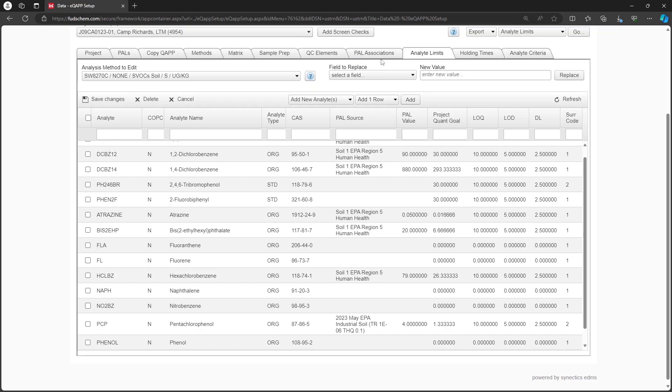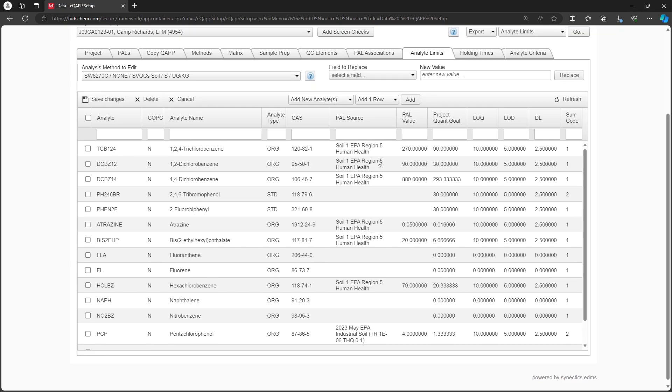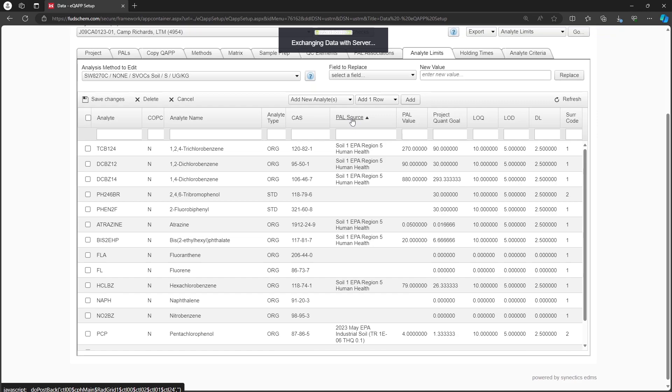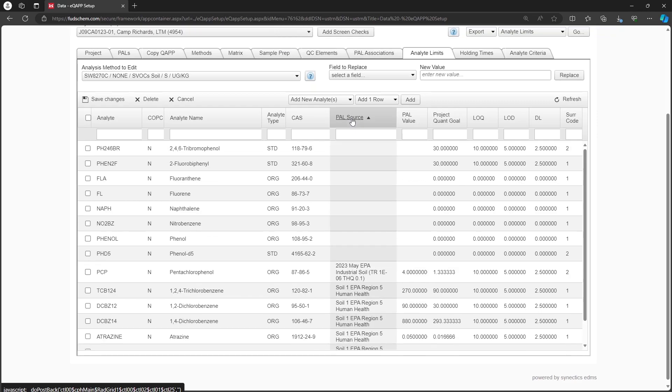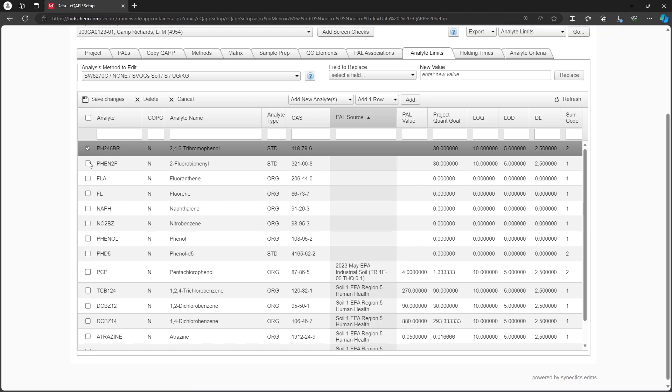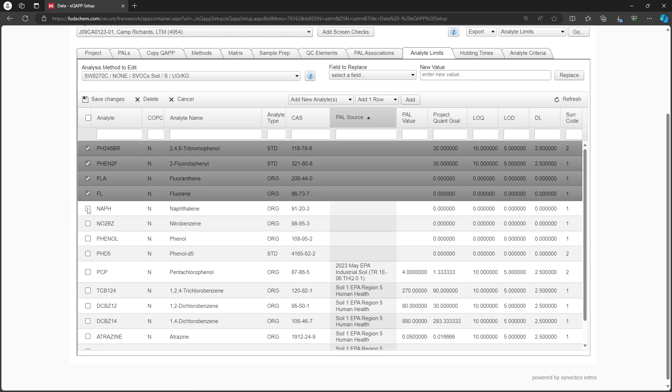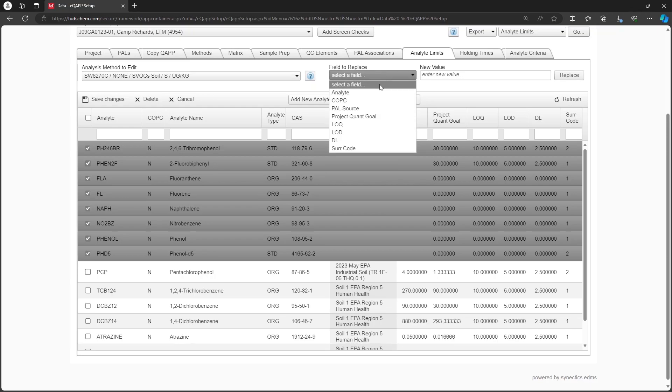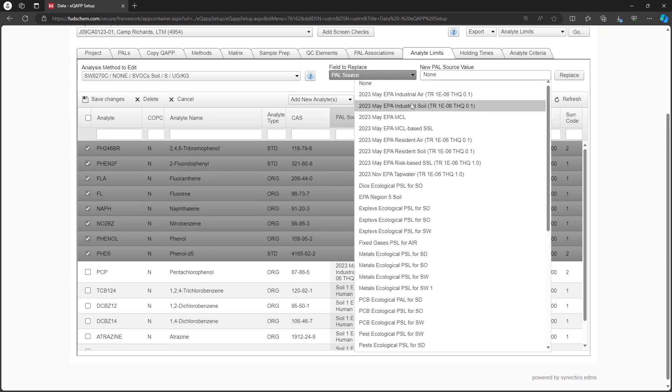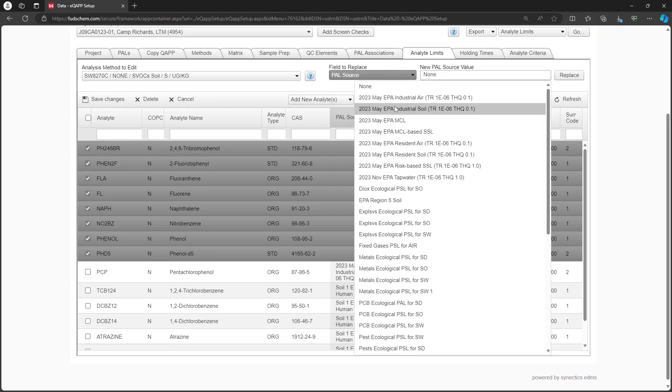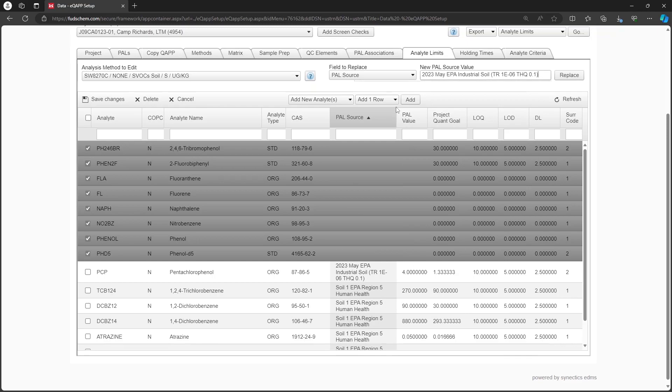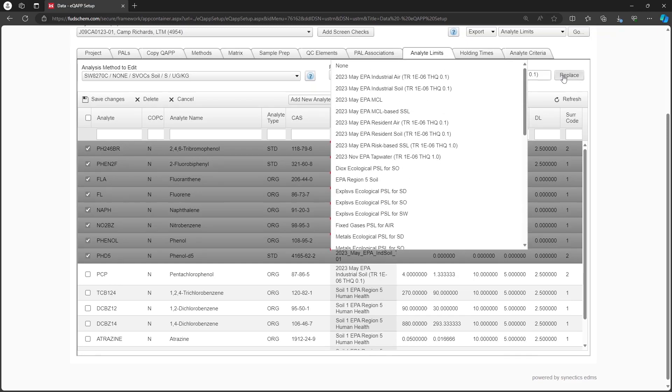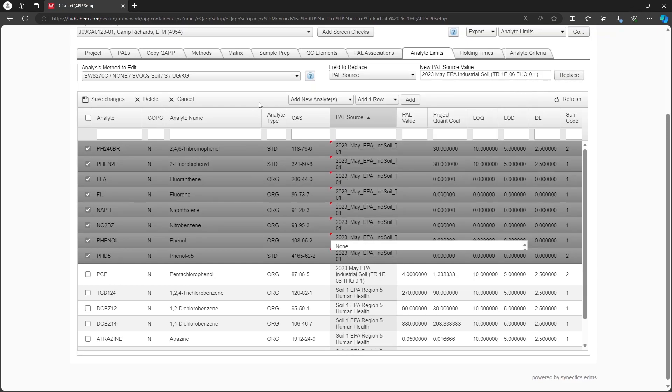In this case, we will set the PAL sources by hand. Let's click on the PAL source column to sort and bring all our blank rows to the top. Select the blank rows and use the field to replace option to choose PAL source. Select the PAL you want to apply to the Analytes. Click Replace, then click Save Changes.